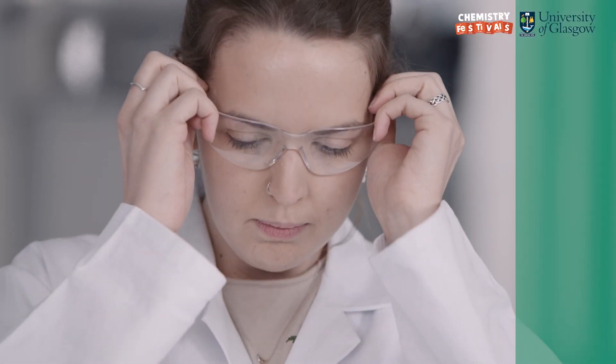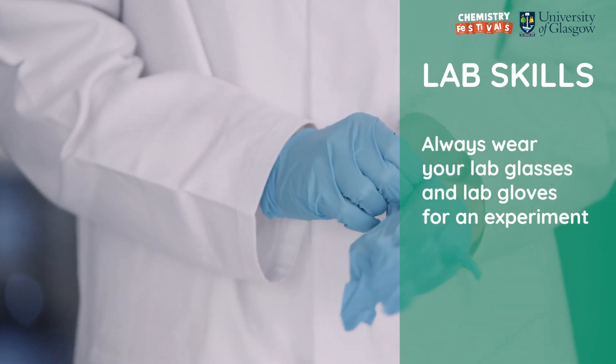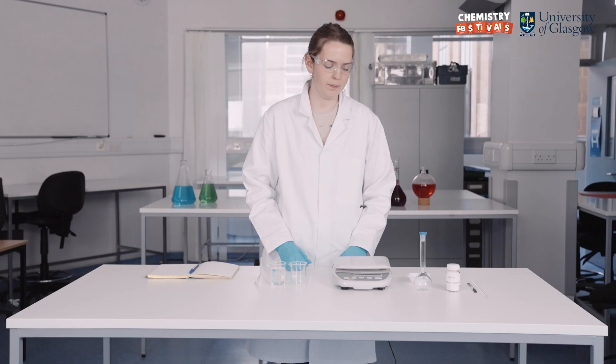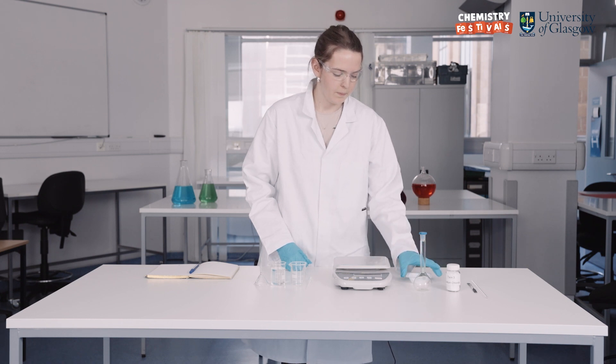Now I will show you how to prepare a standard solution. First I will put on my lab gloves and glasses. Now I'll turn on the balance and tare it to zero. A balance is a technical name for scales in chemistry.